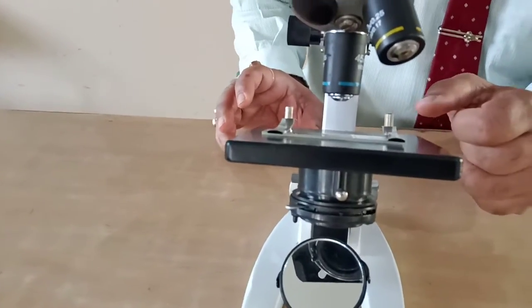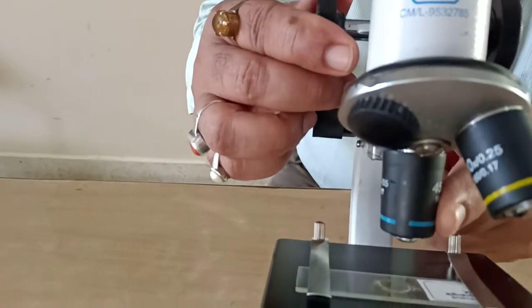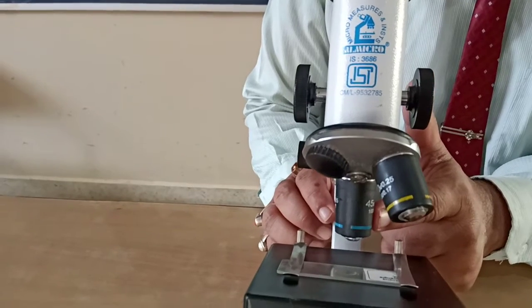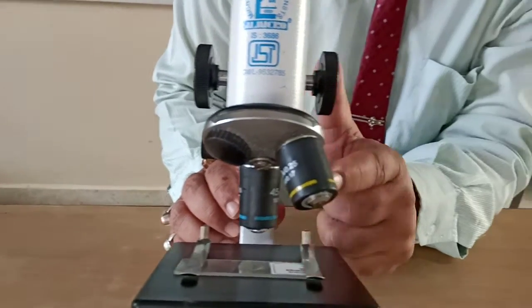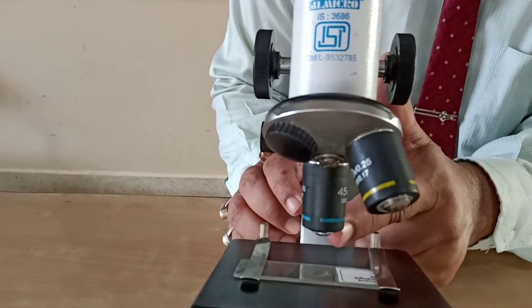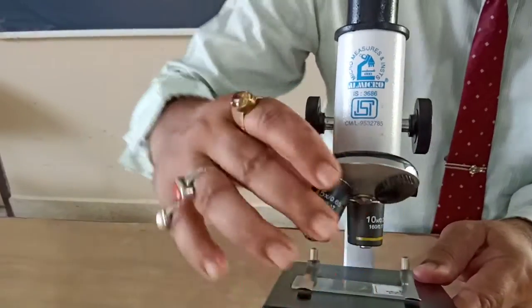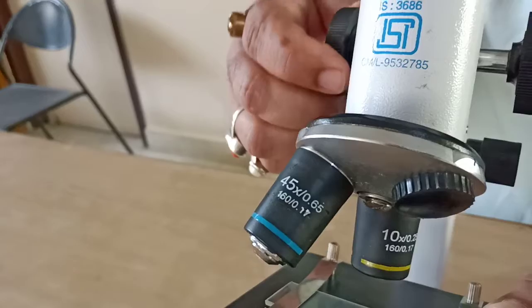The next lens is this one, the objective lens. The objective lens is fitted on this nose piece. The nose piece has three points for setting the objective lenses. The lens which is lying over the slide is called the objective. So if we wish to see with 10x magnification, we have to set it. Now it has been set.